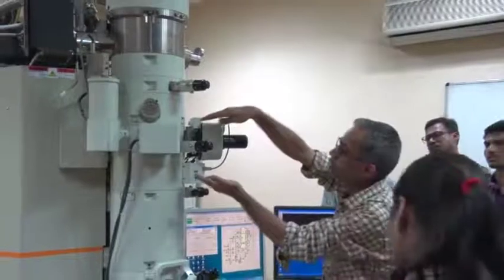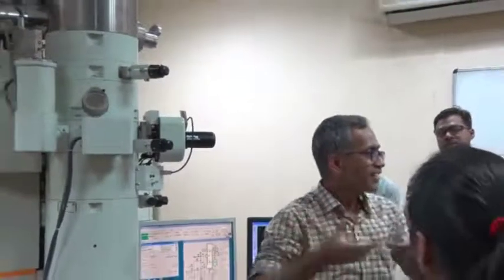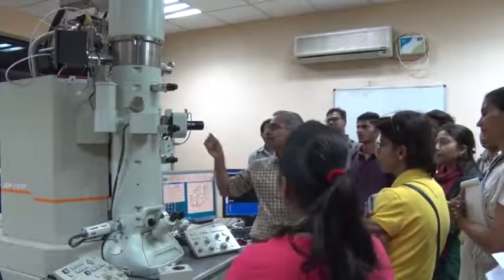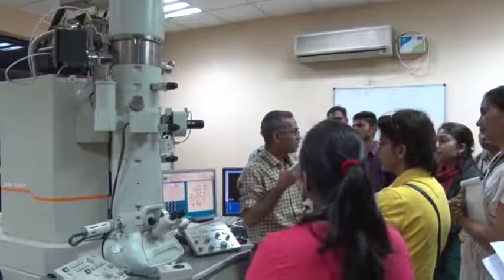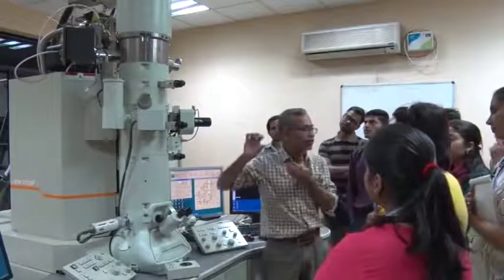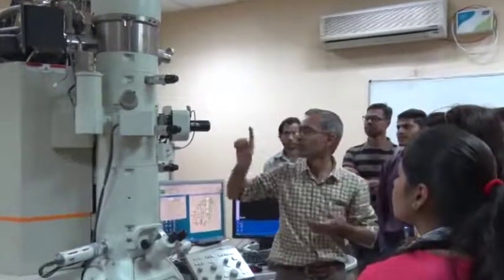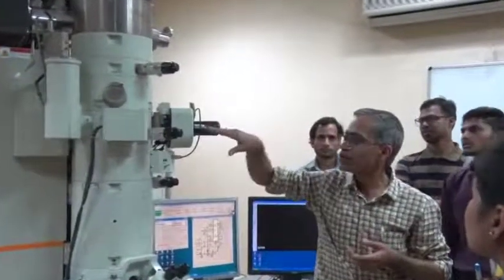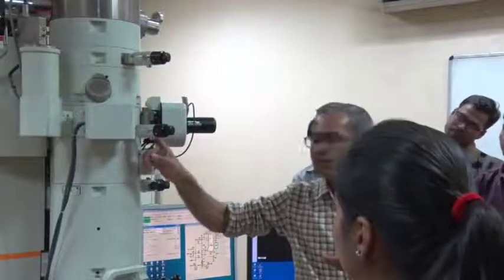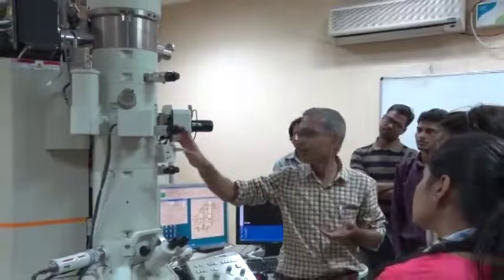Then followed by that we have the objective lens, which is in this area. That's the most important part because it creates the first diffraction pattern and first image. The quality of the image is dependent very heavily on that. Many of the important components are located very closely in that closed space. For example, this is our sample holder. It is actually sitting almost inside the objective lens. And this is the objective aperture, which is sitting just below the sample in the back focal plane.